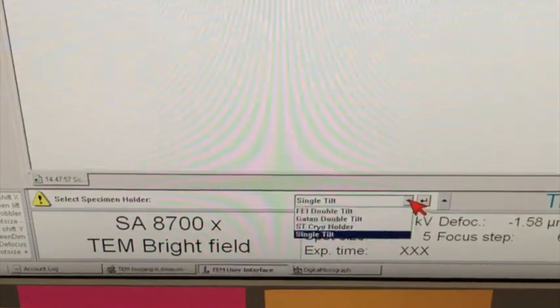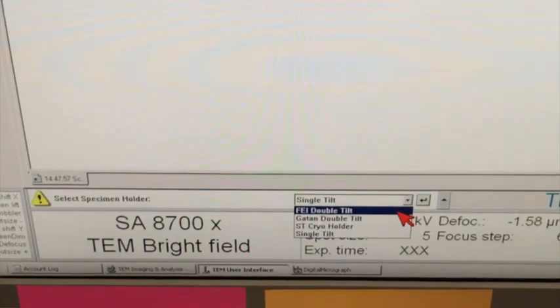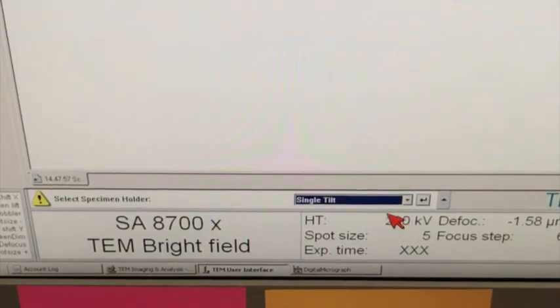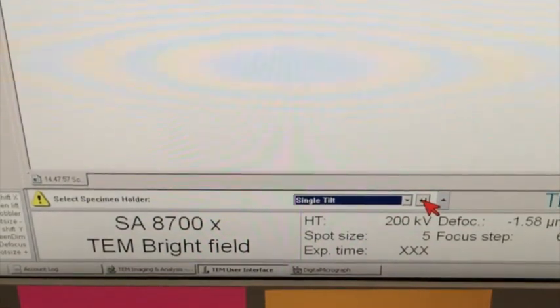The two most common holders we use are the FEI double tilt holder and the single tilt holder. In this case, we use the single tilt holder. So you click on the single tilt holder and click enter.